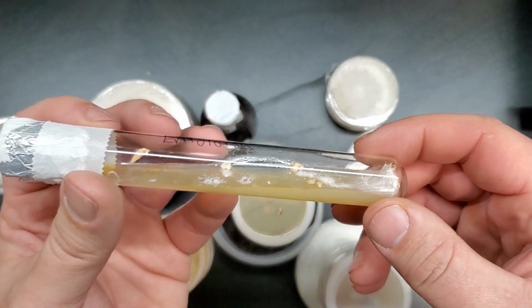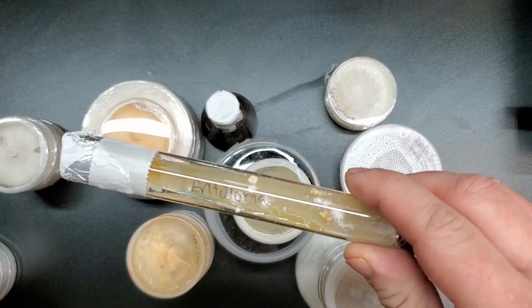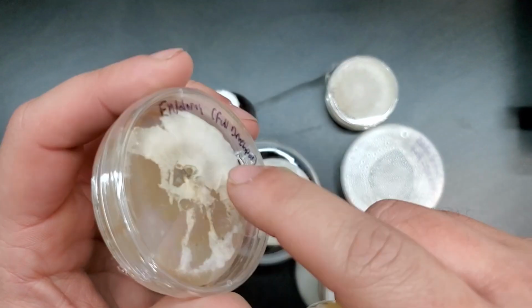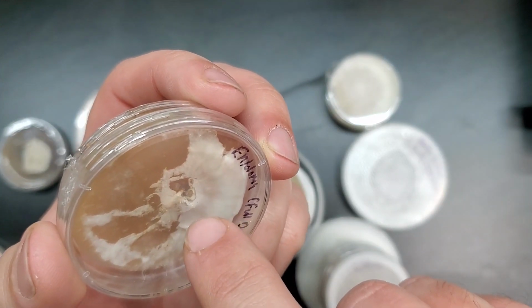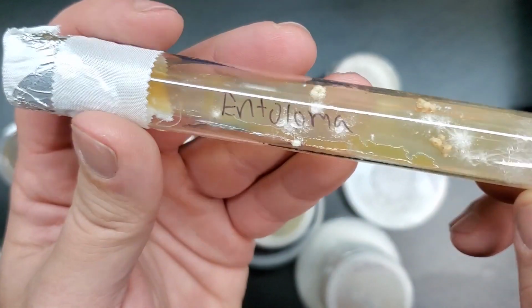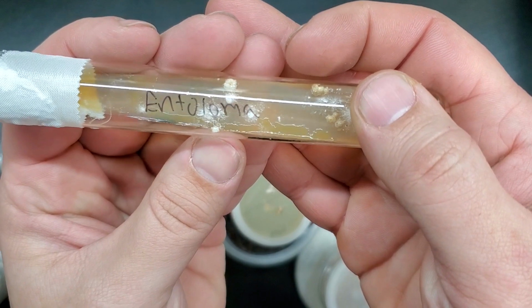And I can show you another one here. This is actually a culture slant that I was just kind of playing around with. I'm fairly sure, I forgot to mark whether this was the fully developed or the aborted form of the Entoloma, but I'm fairly sure, where's it at? Hold on. Yeah, I'm almost positive it came from the middle of this guy right here, because in this petri dish with the fully developed Entoloma tissue sample, I noticed that there was another one of those nodules that looked like a shrimp of the woods. And I used that to inoculate this culture slant down here. And unfortunately, I don't know how well that's coming through on camera, you can see right here, I think that's yeast. Like a small yeast contamination down the side.